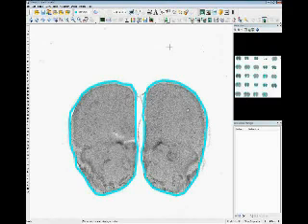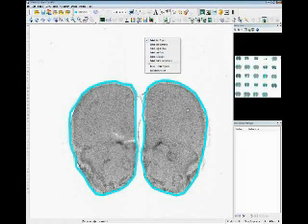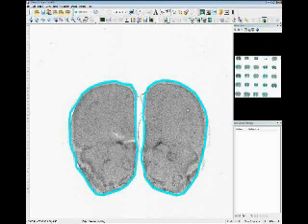If you'd like to do multi-point selection, so multi-point editing, Select Objects, you right-click and say Select Points on Contours. And now you can select individual points. You can see that they're highlighted in red where the other points have a white center. And now we could move those selected points or delete them. And so this is one way that we can easily modify certain points in our contours without the tediousness of doing each one individually.